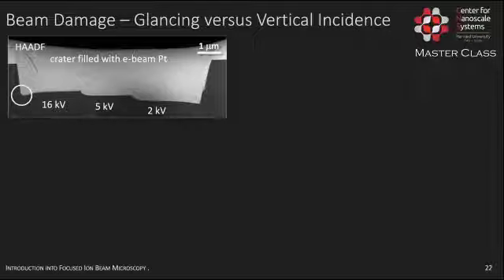I also want to point out that the intensities, which are actually gallium concentrations, are reinforcing what I have said before, that in this damage zone we have extremely increased the gallium concentration, with all its ramifications.